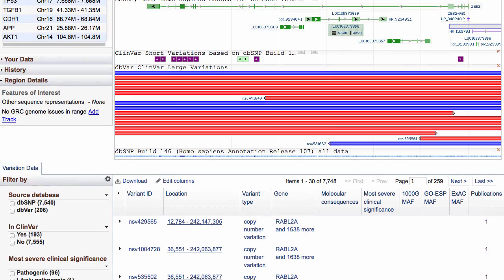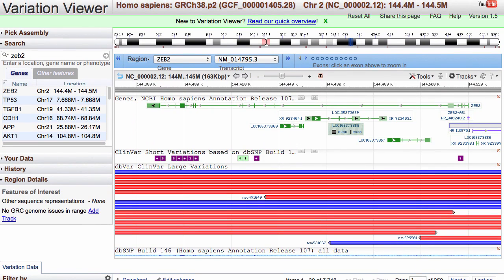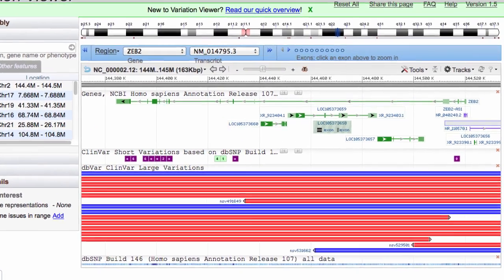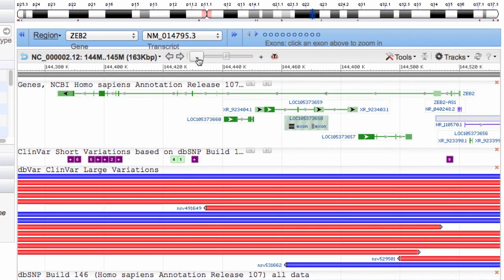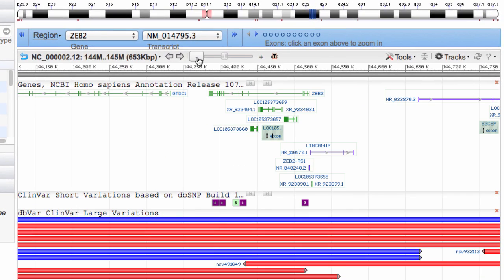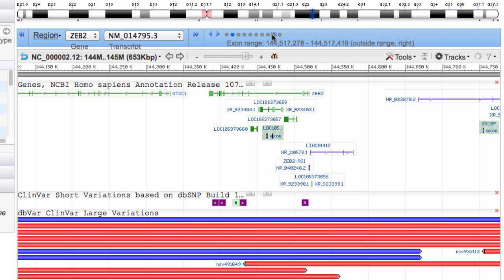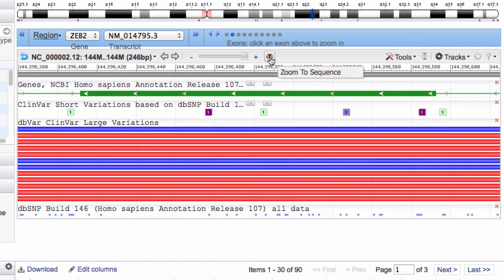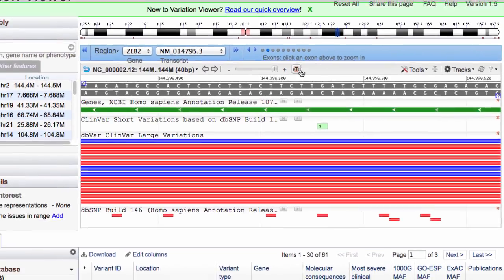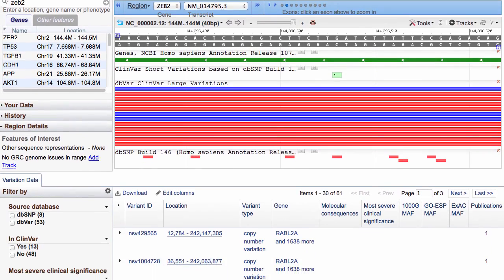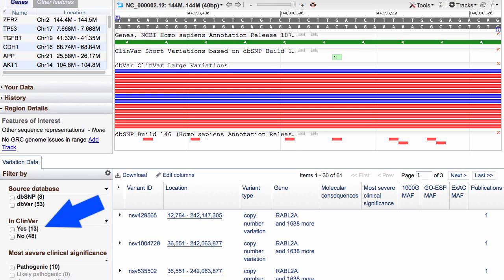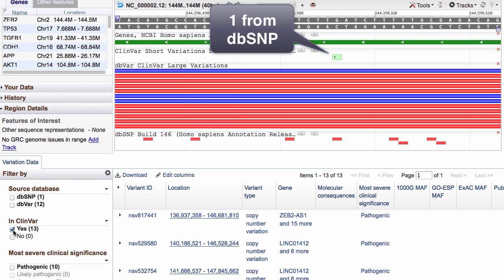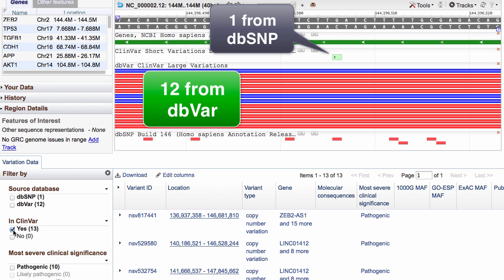The blue and red bars in the dbVar track represent large duplications and deletions, respectively. You can use the zoom bar to see these structural variants at different scales, and you can zoom into a smaller region, like a single exon, to look at individual variants within that exon, or zoom all the way to the sequence level. Notice that the browser section interacts with the table below. For example, if you limit to ClinVar records, you see that there is one ClinVar record from dbSNP and 12 from dbVar in the displayed region.